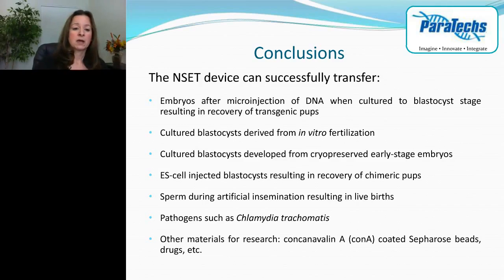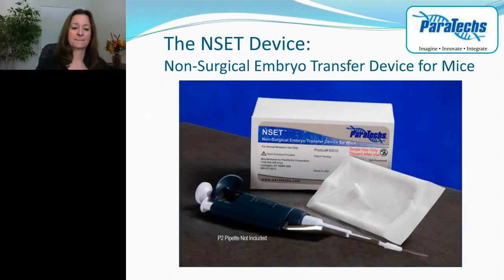A couple of other uses, which we're not going to be talking about today, but have been referenced in the literature, is that you can also transfer pathogens using the non-surgical embryo transfer device, and other materials, for example, Con-A-coated Sepharose beads. Drugs can be delivered this way, and a multitude of other materials that can be used for research.